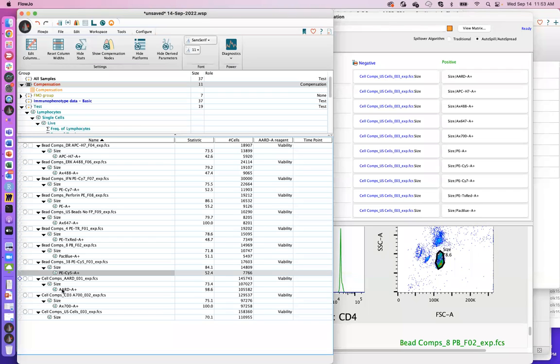But I'll tell you guys, if you're going to use this in the future, treat your autofluorescent cells as part of your panel. So if you know that the cells are autofluorescent around 550 nanometers, then make sure that detector that's in that range is left open. Don't put a color there. In this case, a lot of times the cells are actually autofluorescent around 650 nanometers. So the Alexa 647 channel is actually pretty perfect for that purpose.